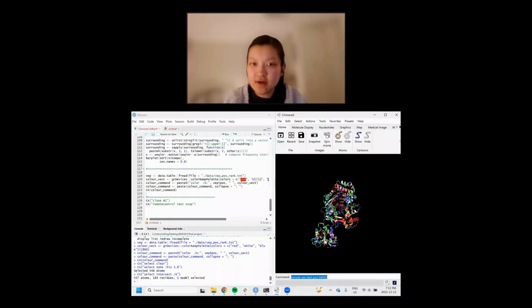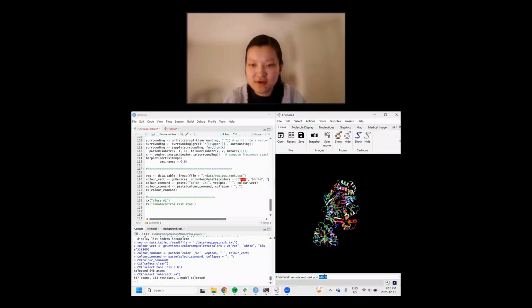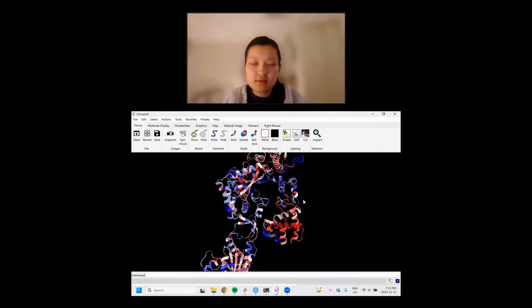All these residues are colored, and I still have some stuff selected, so I can just write a command. Actually, you can just do it directly in the command line over here. Using the interface doesn't limit you from using one or the other. So I can do select clear. And then, yeah, let's go to the full screen in ChimeraX.